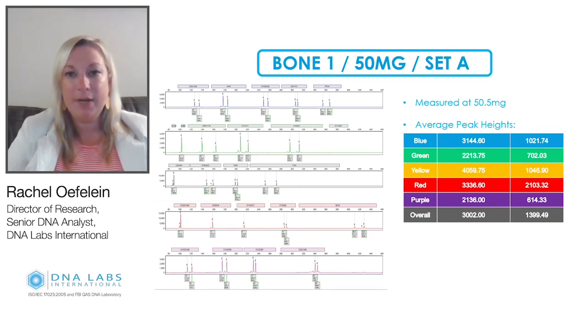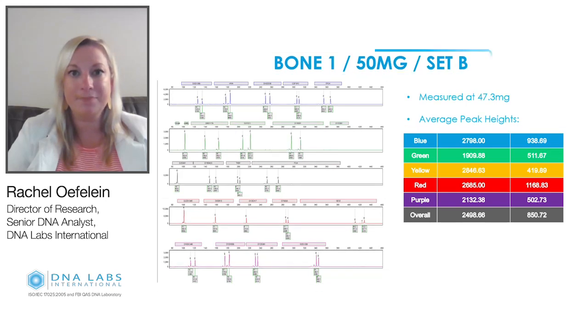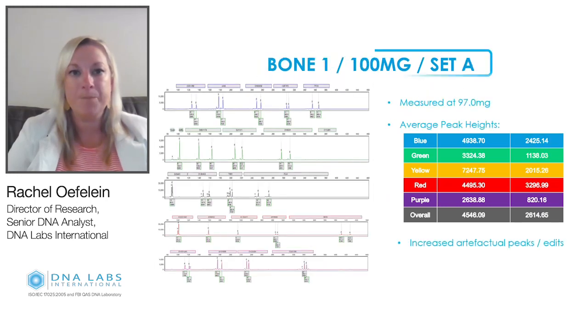Going up to 50 milligrams, set A. You can see here we have a slight increase now in the peak heights. And similar again for set B. Even though this was 47.3 milligrams, so slightly less input, you're really not seeing that big of a difference.